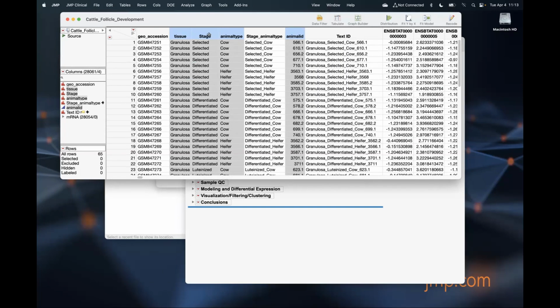I did the same thing here because many times, instead of doing this as a full factorial, expressing it, sometimes you can just concatenate two columns, did it the same way, and we'll just look at these as our comparators, right? Effectively the same thing, but it turns it into a single level instead of a multi-level, and that works as well. That's just as functional, right?